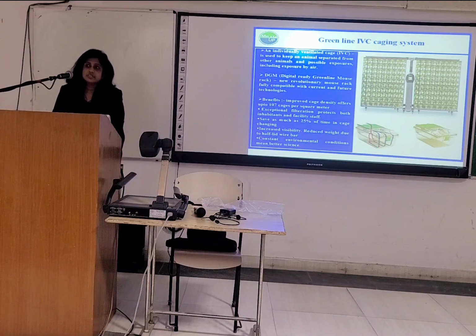This is green line IVC caging system. IVC stands for individually ventilated cage. It is used to keep an animal separated from other animals and possible exposures, including exposure by air.